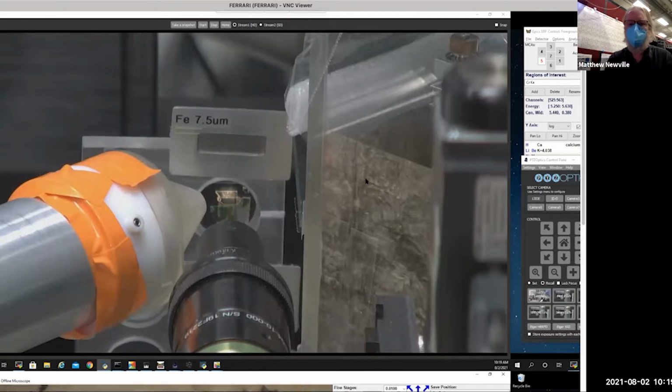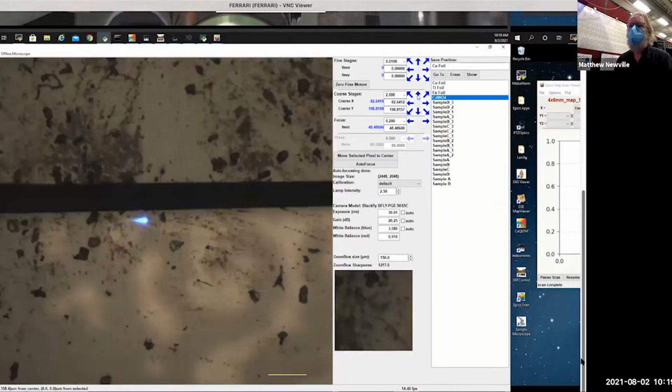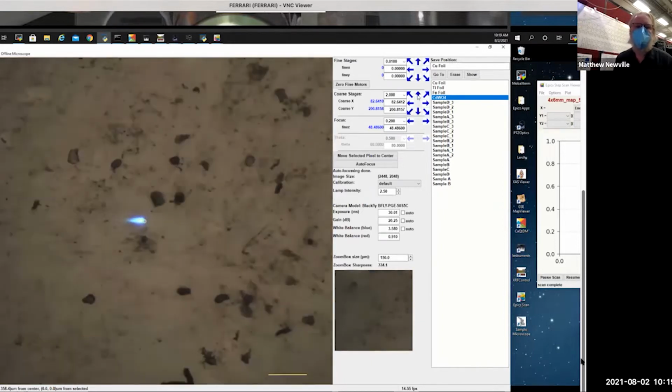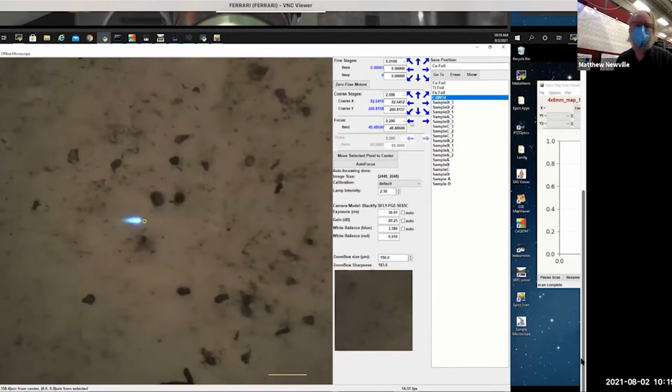If I go back to showing you that microscope image, I'll do the same thing where I push on this to move this sample up and down, the crack in the phosphor. And one thing for fluorescence work that we always show people is that the image is in focus, but that's focus defined by the optical microscope that's at 45 degrees of the beam. The sample sits at 45 degrees. If I go in and out of focus, the sample moves right and left because I'm moving the sample relative to the focal plane of the microscope.